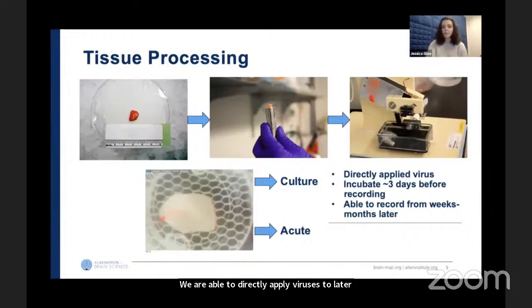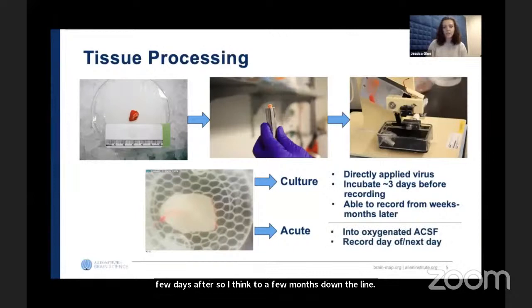Acute slices are placed into an oxygenated ACSF that contains sodium so cells can fire as normal. These slices are recorded from by the electrophysiology team that same day or the day after. Now I'll hand off to the next step in the MET pipeline, electrophysiology.